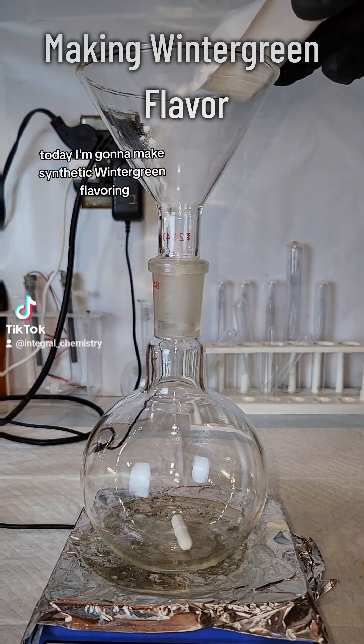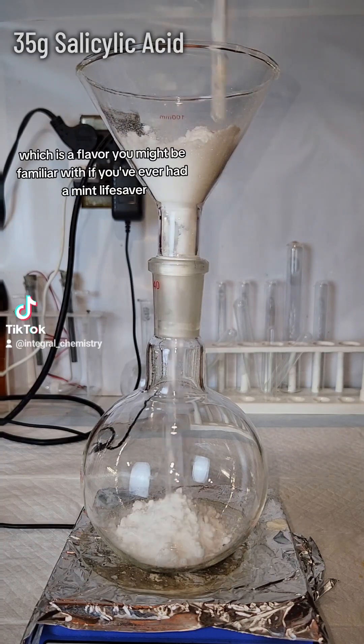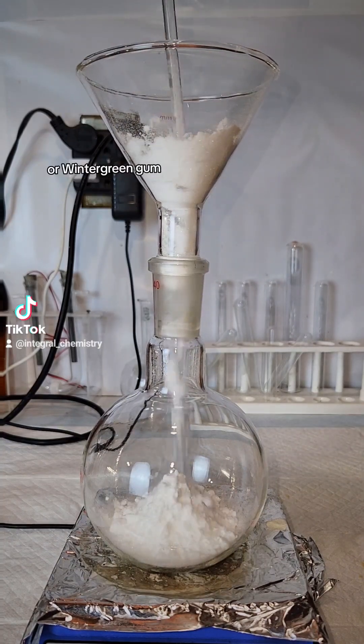Today I'm going to make synthetic wintergreen flavoring, which is a flavor you might be familiar with if you've ever had a mint lifesaver or wintergreen gum.